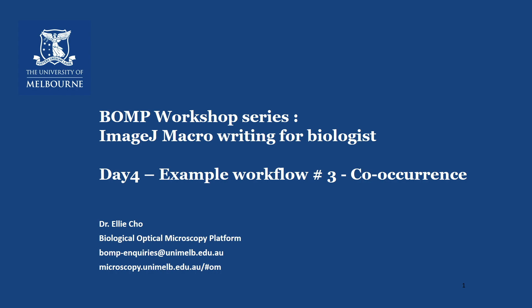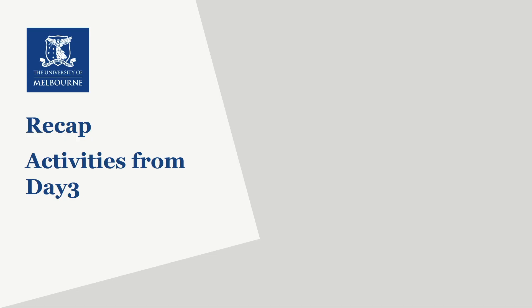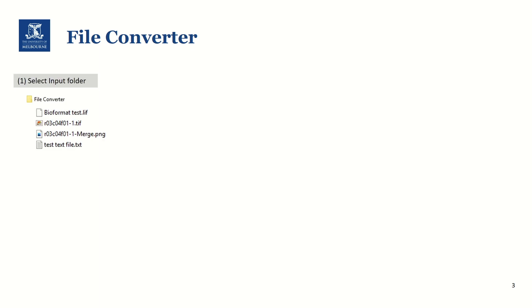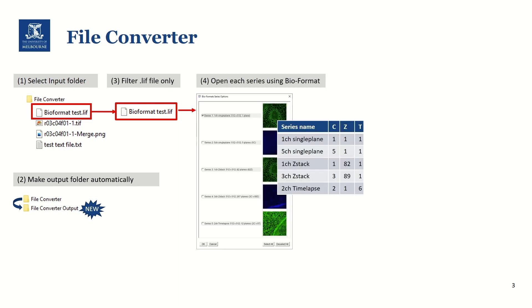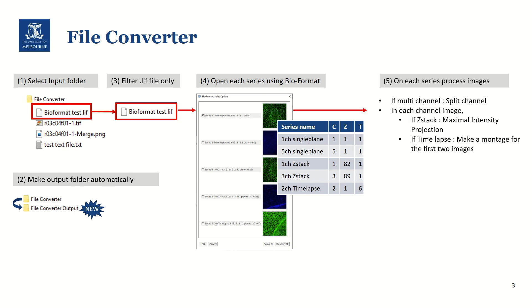Welcome back to Day 4. Just a quick recap on the activities from Day 3. In this file converter script, we have selected the input folder and let ImageJ generate the output folder automatically. And then we have filtered the files based on the filename using two arrays and used the BioFormat plugin extension to open each series. And we have processed images further.